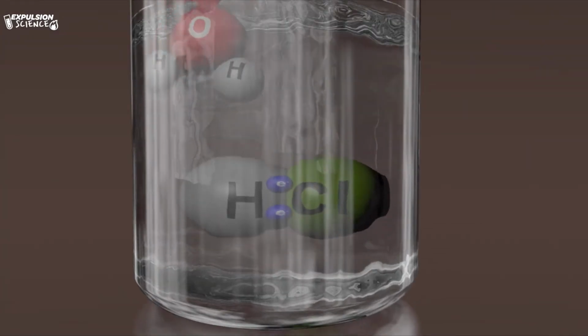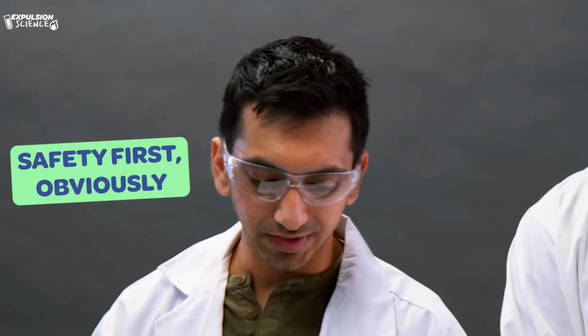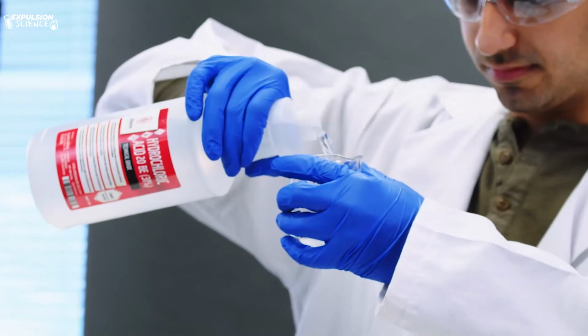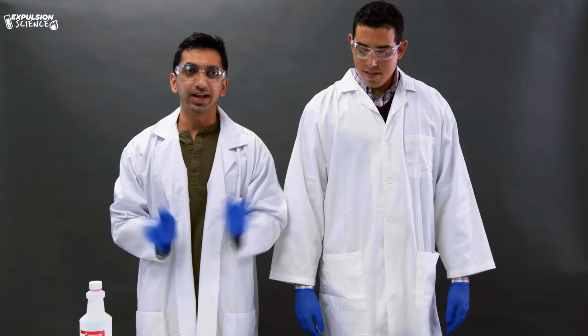Hydrochloric acid is a pretty strong acid. When we pour the hydrochloric acid in with a solution, it'll start to disassociate and the chlorine atom and the hydrogen atom will separate from each other, creating a strong concentration of hydrogen ions, and those will tend to react with a lot of different things, including human skin, which is why we're wearing lab coats, gloves, and goggles today. Safety first, obviously. Yeah. All right, so we're going to pour 100 milliliters of hydrochloric acid in each of our mason jars. And then we're going to place the metal in them and see how they react.